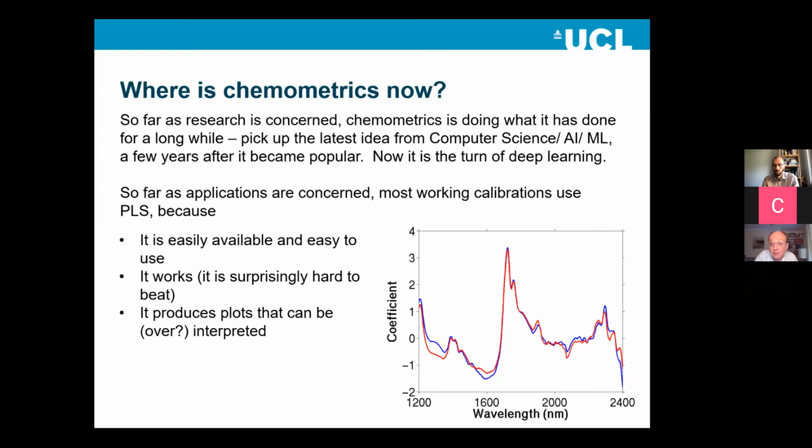Most working calibrations still use PLS through all of this. And that's because it's easily available. So it's available on lots of software. The instrument manufacturers always put it on their software, and it's relatively easy to use. It's quite hard to screw up. And it works.